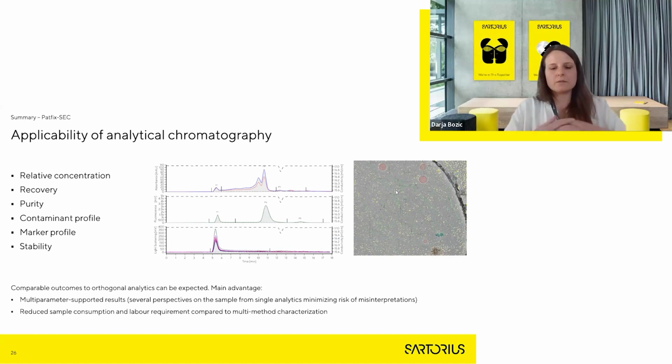We don't have that much experience with plasma samples, but for sure the running buffer should be optimized for this particular sample, with the addition of some anticoagulants or protease inhibitors. I'm just guessing. And the solid phase of the chromatography column might be selected according to the properties of this particular sample. Hope this answers.